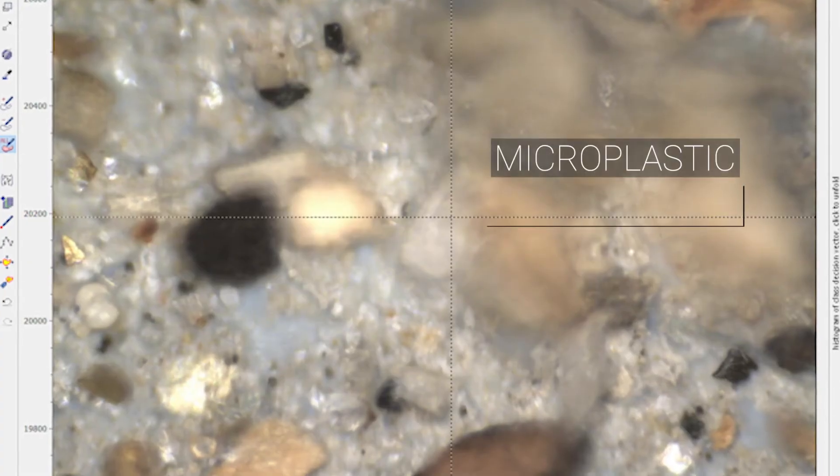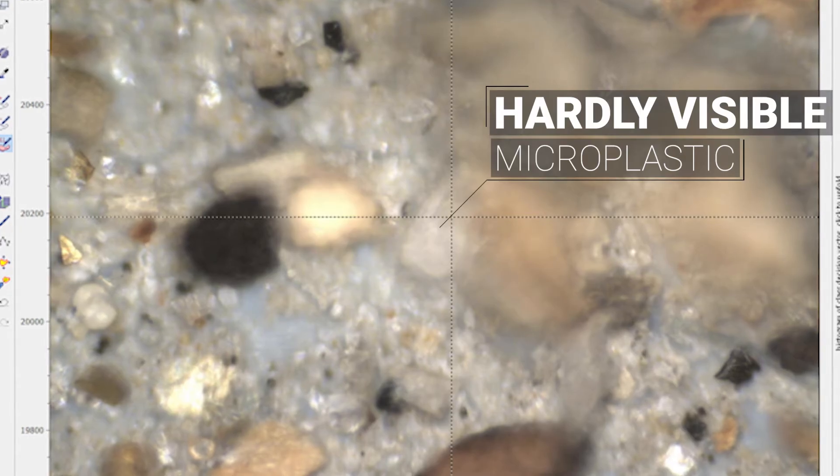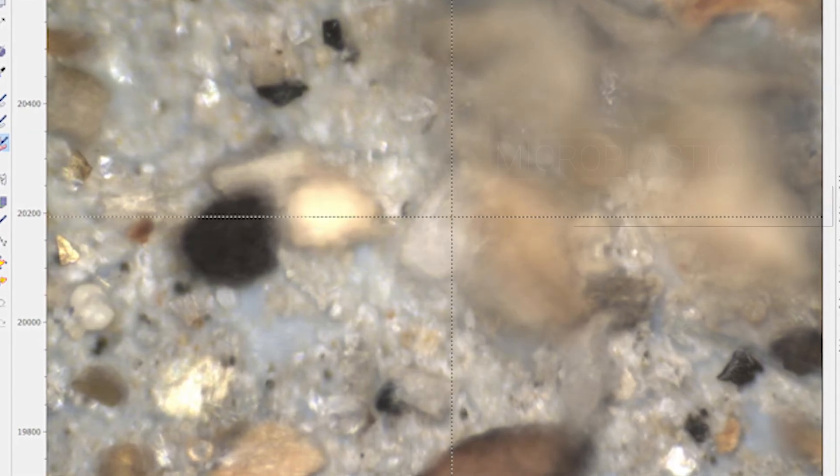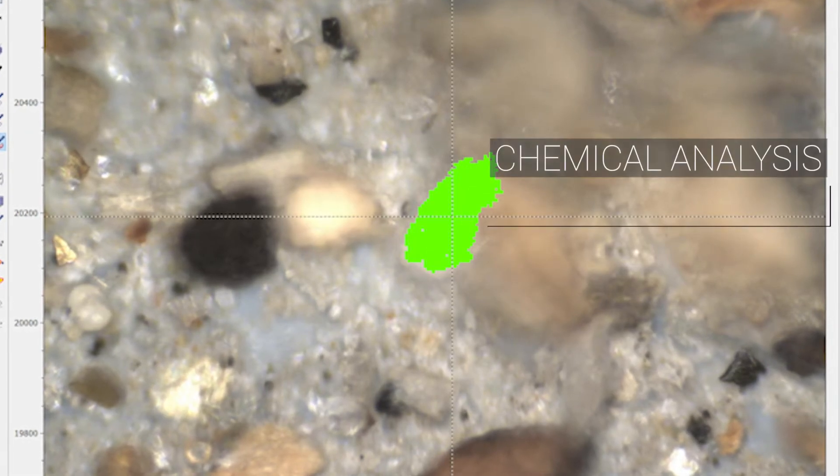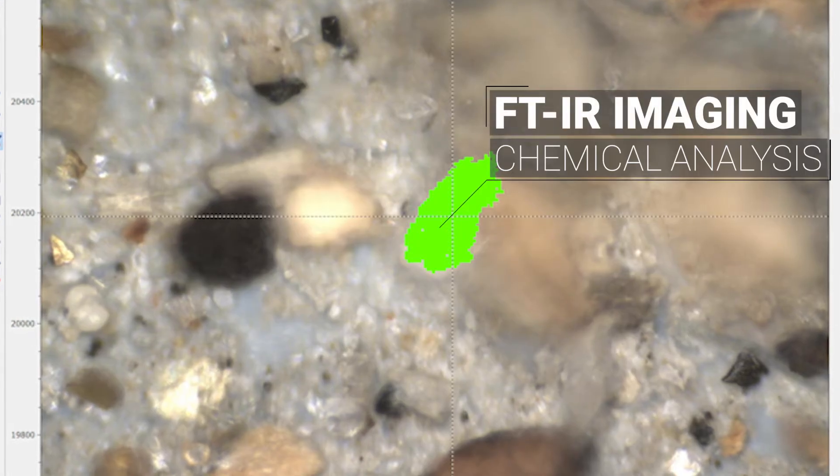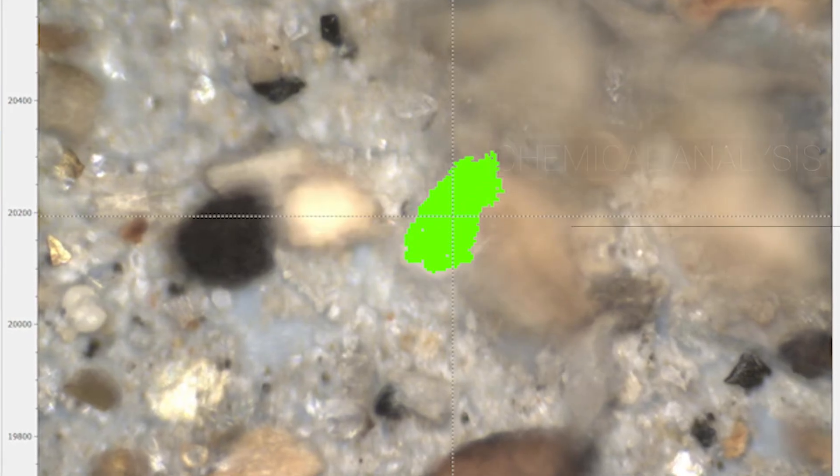The reason is simple. In a purely visual search for particles, transparent or invisible microplastics are often missed. In comparison, FTIR imaging retains all the important information that provides clues about a particle's chemistry. If microplastic is present, it is detected. Every time.